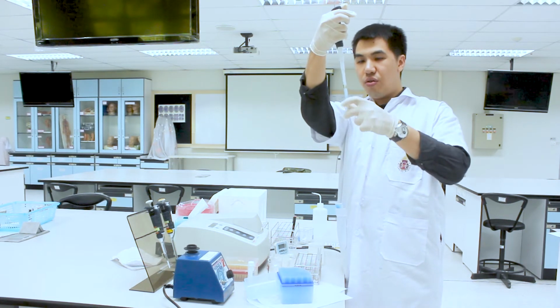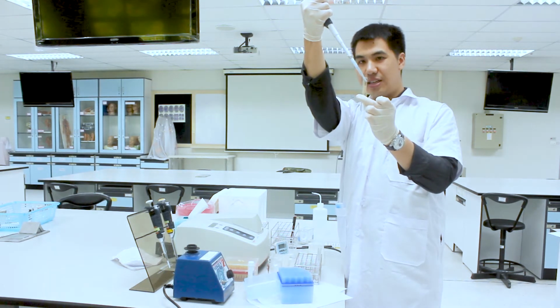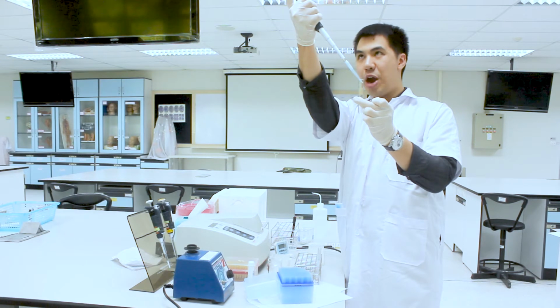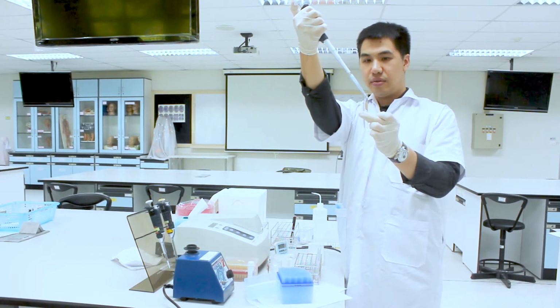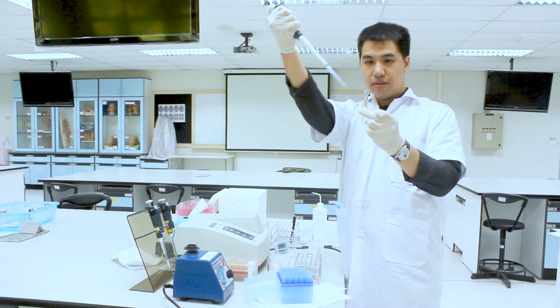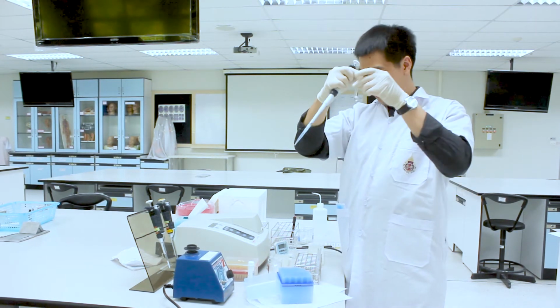Add it against the wall of the test tube like this, and then slowly press down the tab of the autopipette. Here you go. This is the solution without any air bubbles.